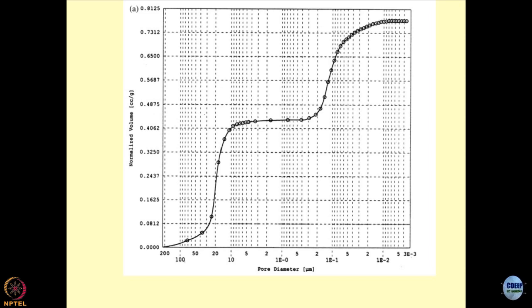The first part of the graph shows pressure increases, volume increases, fine, and then there is a situation where the graph becomes constant. The graph becoming constant indicates that the volume of the mercury which is going into the pores is becoming constant. The simplest possible analogy would be, if you consider the particle size in this range of the pressure which you have applied, they are all filled up with a certain volume of mercury, is it not? Beyond which, if you want to further pack the pores with the mercury, you have to apply very high pressures, and that is where the chances are that you might be distorting the pore structure.